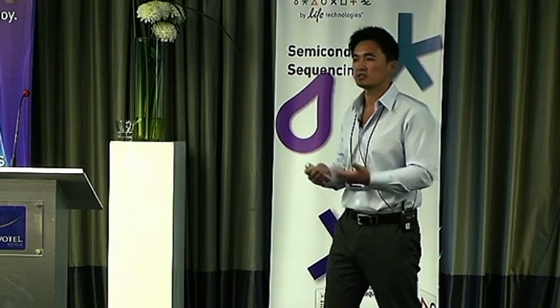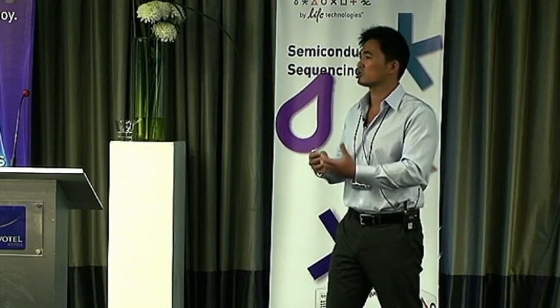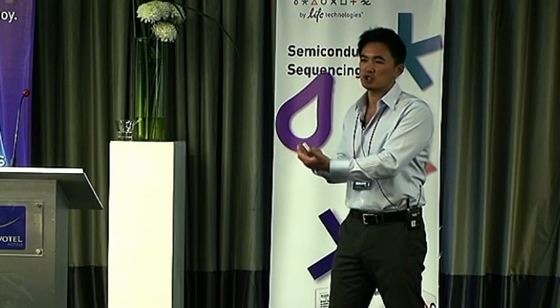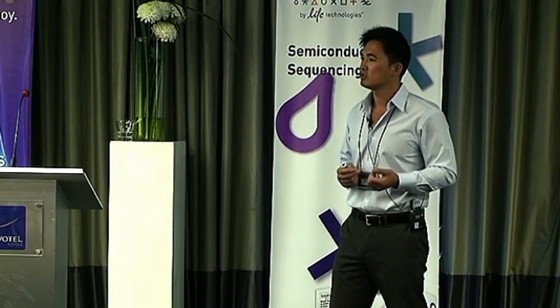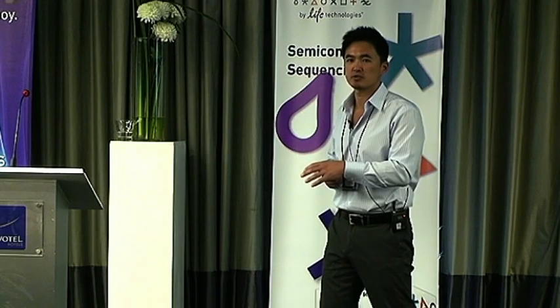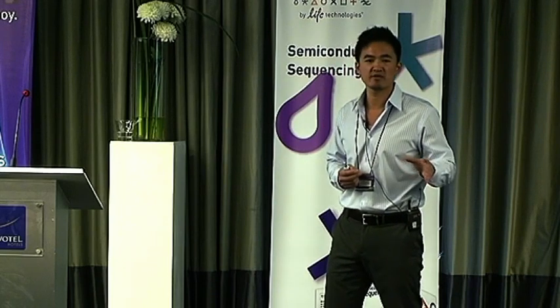If you think of it in terms of molecules per volume, the CT number is actually shifted dramatically to the left. What would be 35 cycles in a traditional real-time system would actually occur at around 25 cycles.